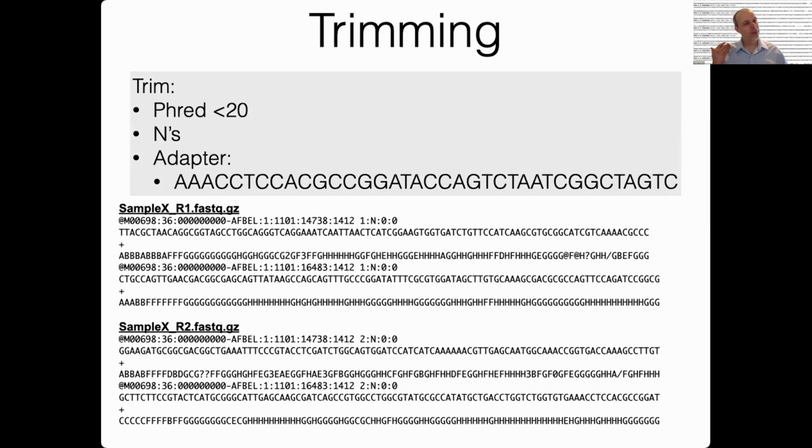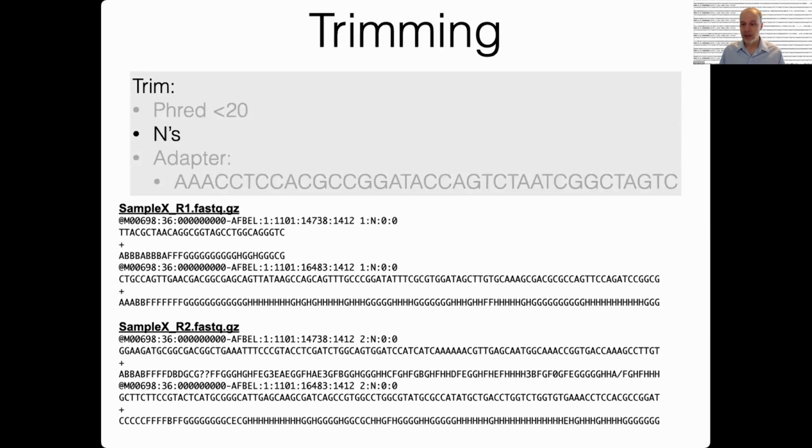For RNA-seq, like I said, with the trimming, there's some evidence to suggest that it actually doesn't give you additional value. So in that case, maybe you shouldn't even be trimming at all. But there are situations in which it might be reasonable to substitute an N for low quality bases. That is not what most software does. I can't speak to whether there might be software out there that will substitute Ns for bases that are low quality. I'm not sure. Yeah. Other questions before I keep going?